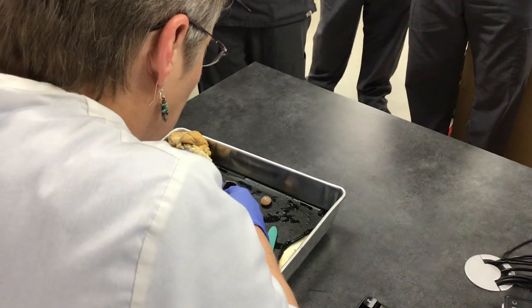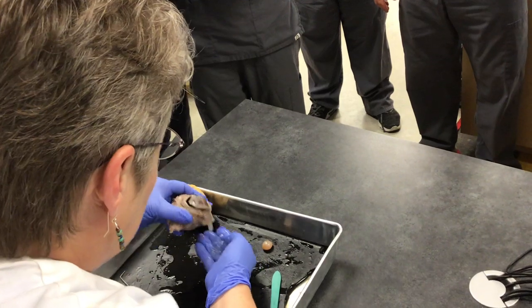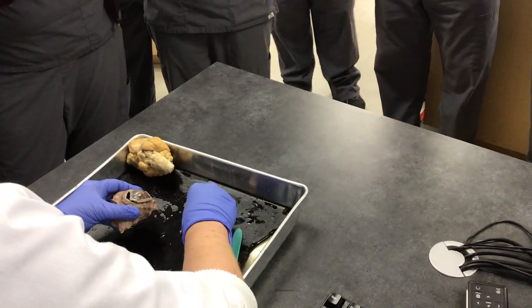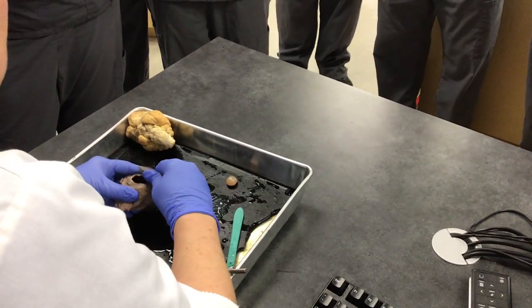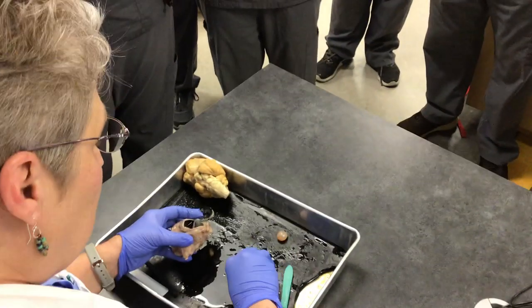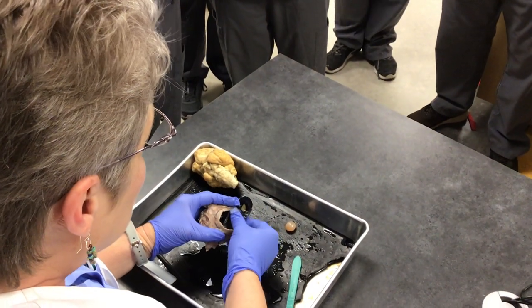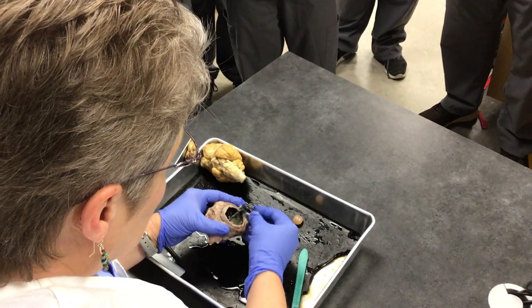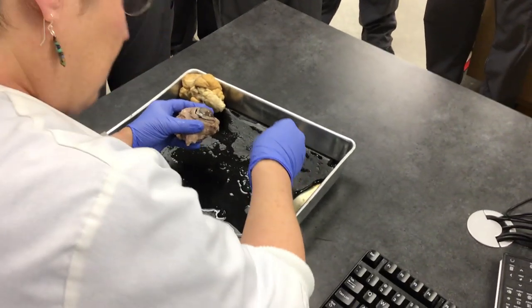Now this other stuff, which I'm going to scoop out — this is more like a jelly substance. This is referred to as vitreous humor. It is found behind the lens in the posterior cavity. We wouldn't be able to see through this, so it makes sense that it's behind the lens.